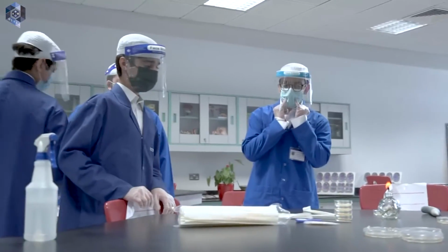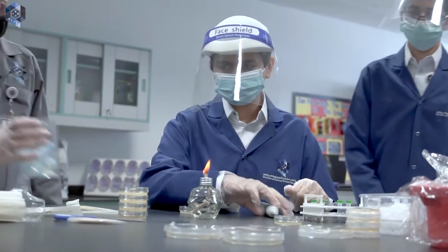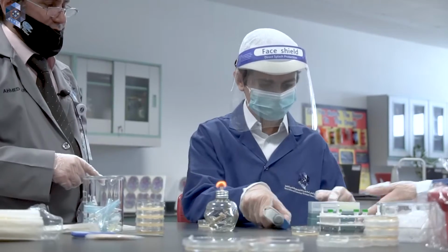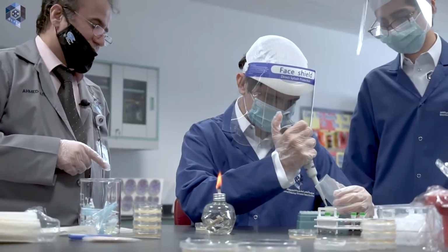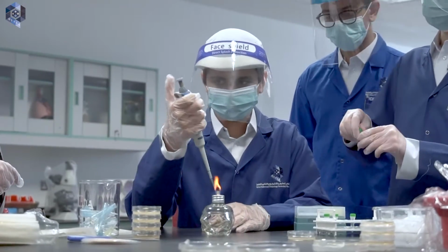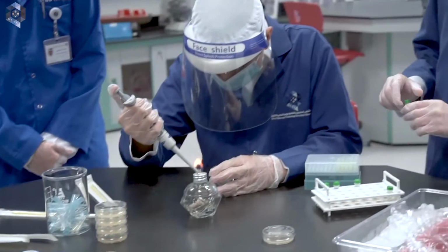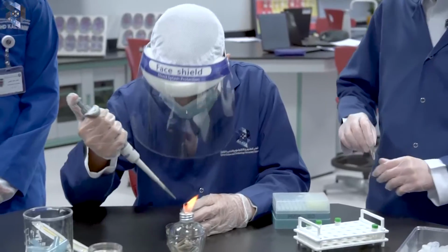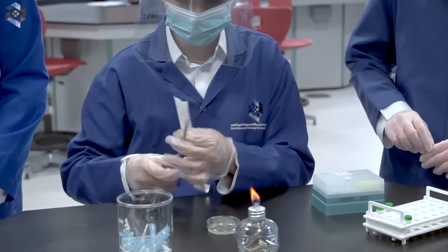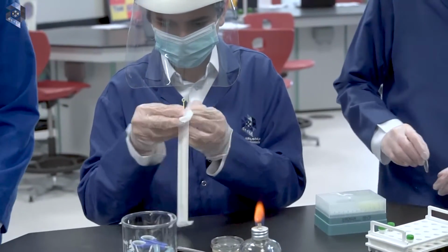Bring the beaker for the discard. Take one of these tips. The yellow one. Good. Discard. 100 is the maximum. No, it's good.